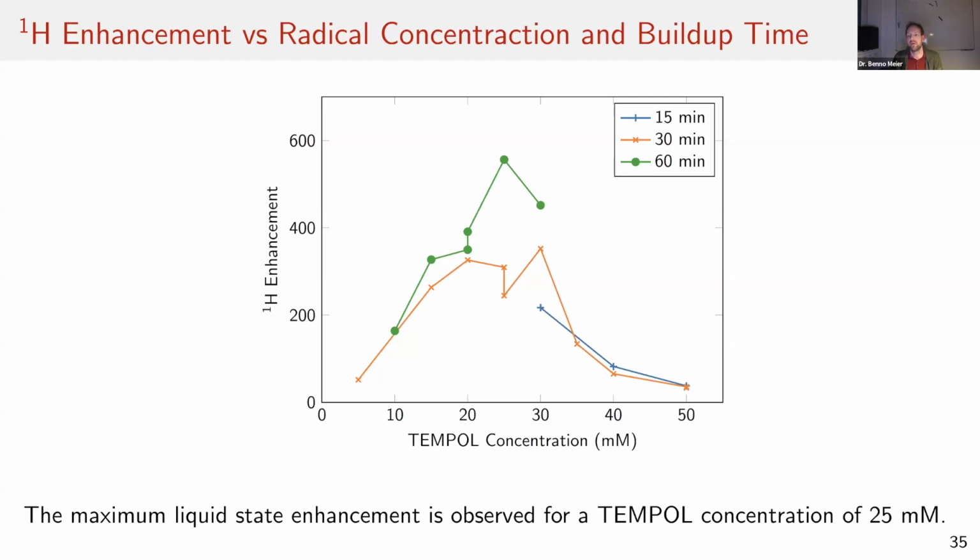Maybe water is of course a problem when you work with really low concentrations. You want to really open your receiver gain, and so you need to very carefully suppress all the signals that you don't want to see. So that would be water. But if, for example, we have let's say DMSO in there at high concentration, or glassing agent, glycerol, or so, we need to be sure that we don't have these things saturating our receiver.